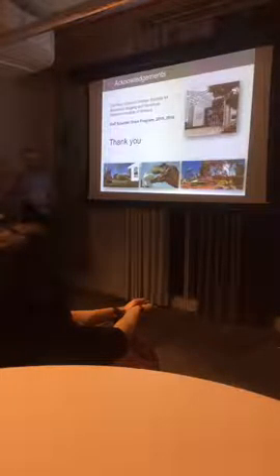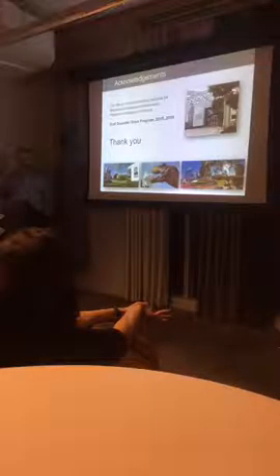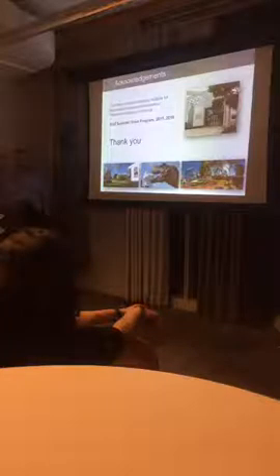There are a few publications where people also do it on a smartphone. But I don't like a smartphone because the camera on the smartphone is harder to control the exposure time.